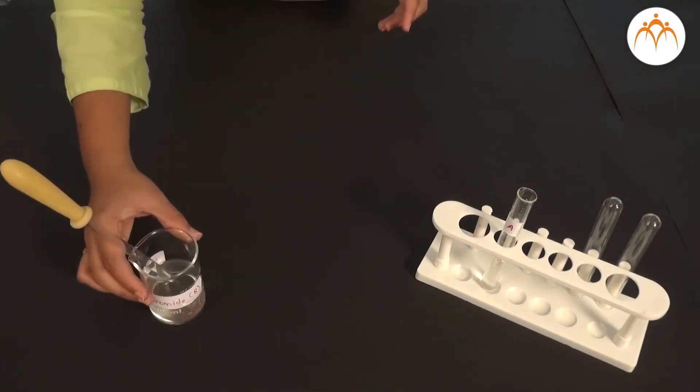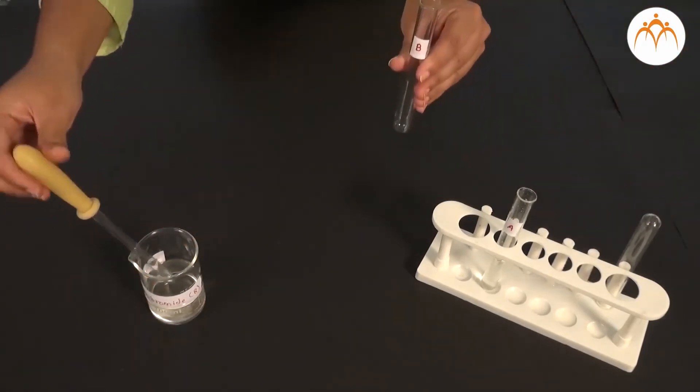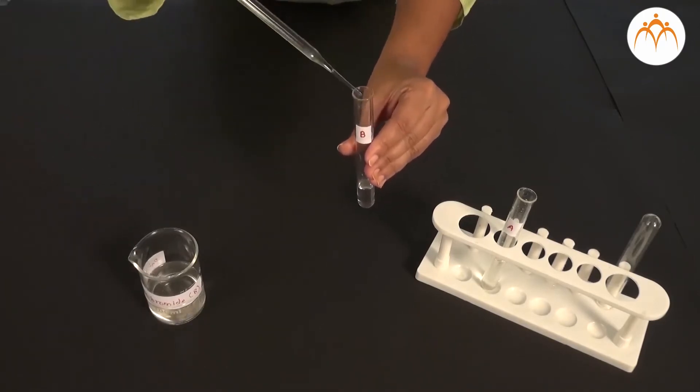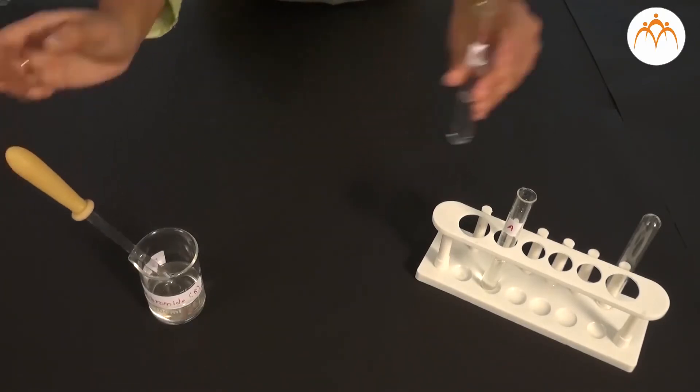We keep these test tubes A, B and C on the test tube stand and add a few drops of silver nitrate to these three test tubes. Silver nitrate or AgNO3 is a reagent and it reacts with the solutions in test tubes A, B and C.